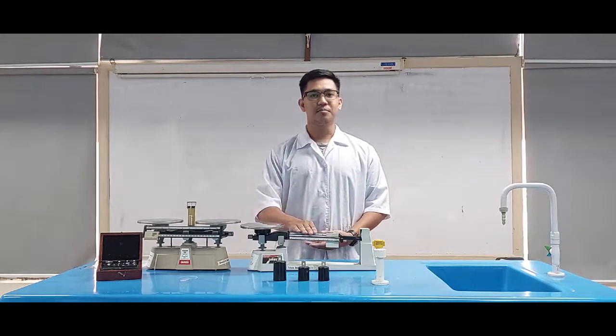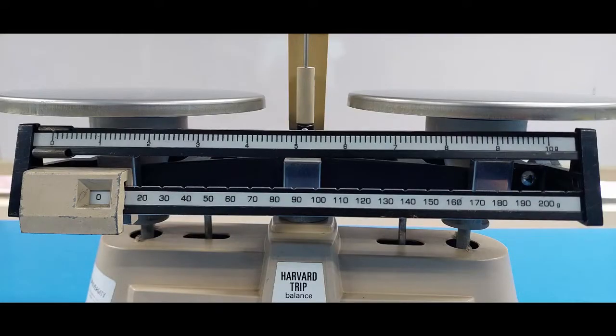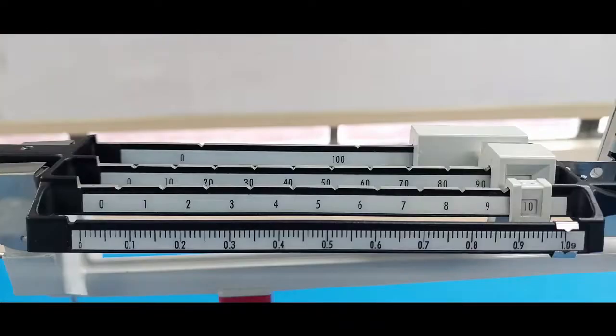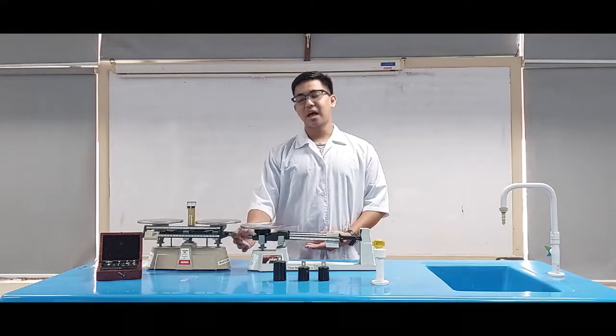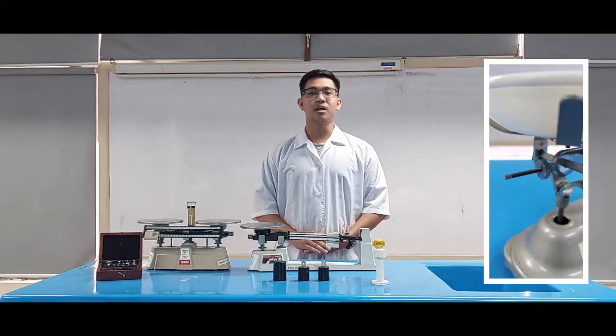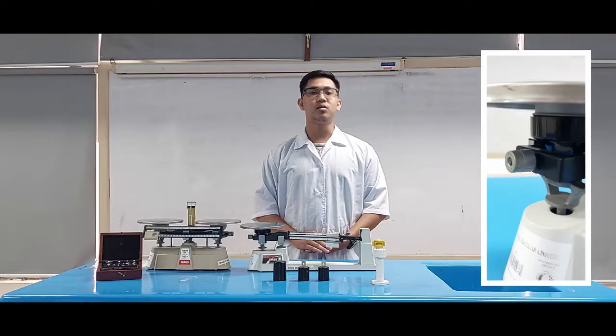The Rider's Beam holds the riders, sets the level of precision, and is labeled with number increments by hundreds, tens, and ones. The Adjustment Knobs are used to manually adjust the beam balance to the zero mark, and can also be used to adjust the pointer.